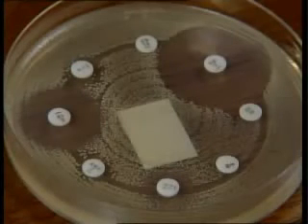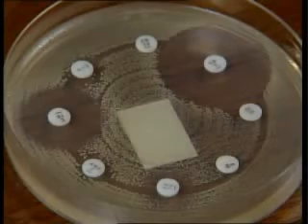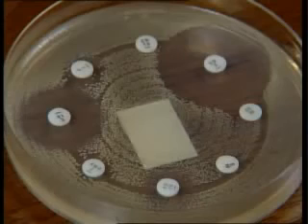If antibiotic discs have not been stored properly, they will lose their potency. The control bacterium has only been inhibited by 2 of the antibiotics tested on this plate. Consequently, the susceptibility of the test strain to these antibiotics must be retested.